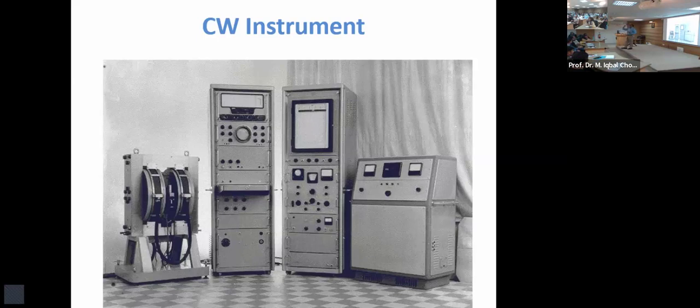It's a natural behavior, exactly like planetary movement. Think of the solar system. The sun is a big magnet, B naught. So why is Earth not static?